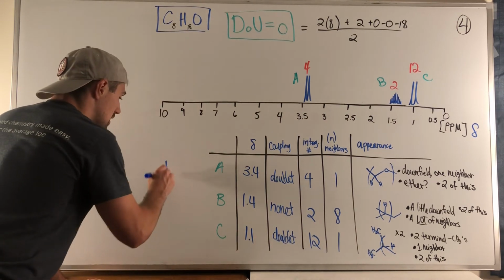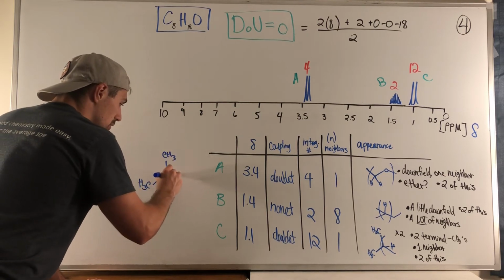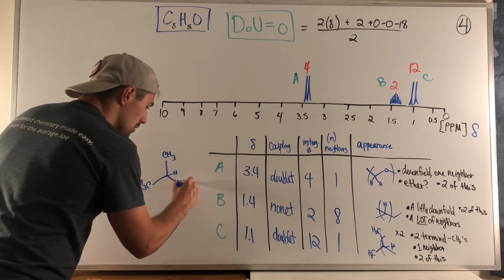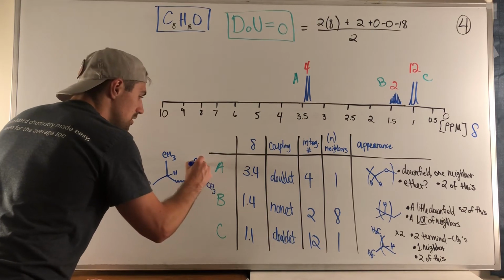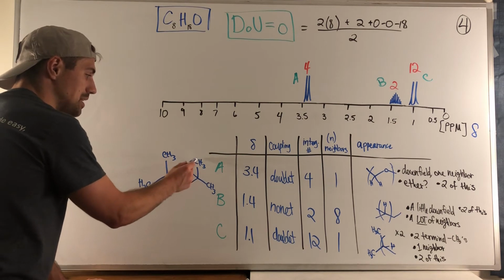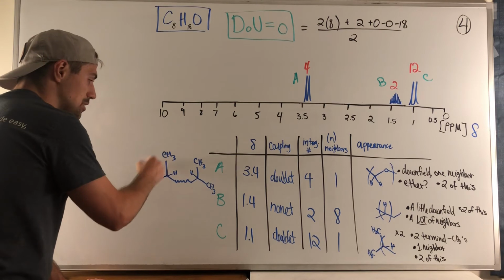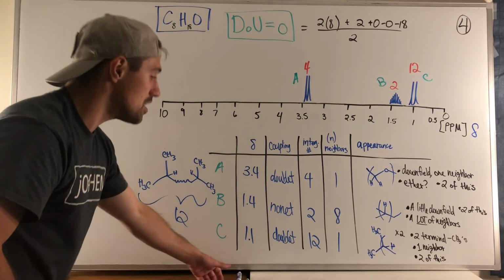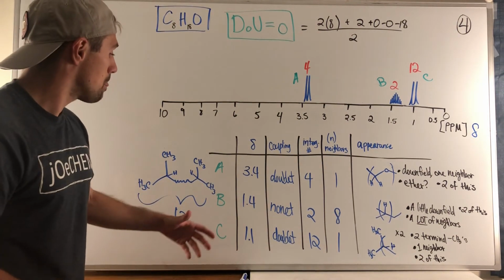So really what I'm saying is, what if we had a CH3, you have the 1 hydrogen right there, the chain continues, and then right along here, you have another CH3, another CH3, another H, so that your splitting pattern, this would definitely be a doublet, 6 hydrogens here, 6 hydrogens here, 12 overall, and you have doublets on both ends. So I think this is a huge key in this problem to recognize and take advantage of.